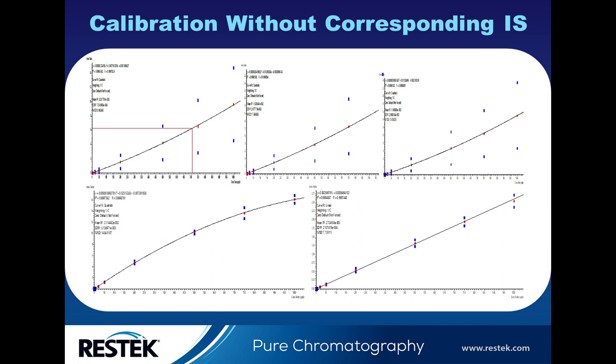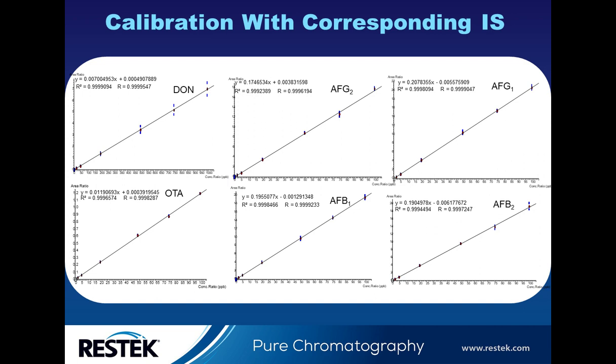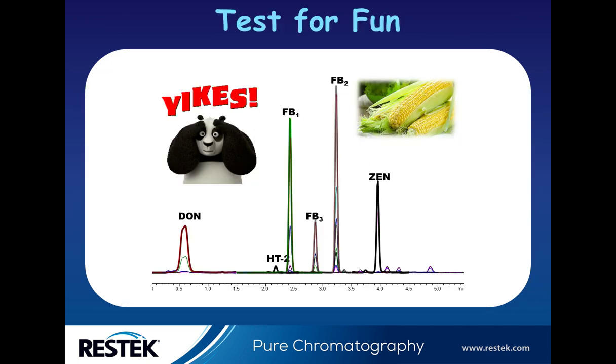But I should say that this is a particular case where we cannot share the internal standard. For most of the clinical analysis, we always share the internal standards. So it's case by case, right? And next, looking at the calibration curves with their corresponding internal standards, it's linear, wide dynamic range, and the two calibration curves are really tight. I only have one thing to say: it's worth the money, right?